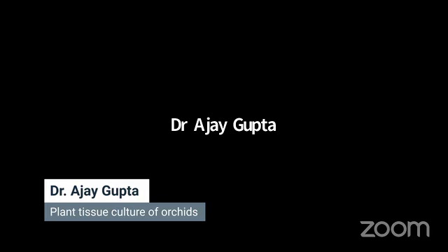Okay, so today the session is regarding the plant tissue culture of orchid plants. Orchids are a very useful and commercial commodity in floriculture, and millions of plants are being exported to developed and other parts of the world. Second, it is used as an ornamental in the floriculture business.